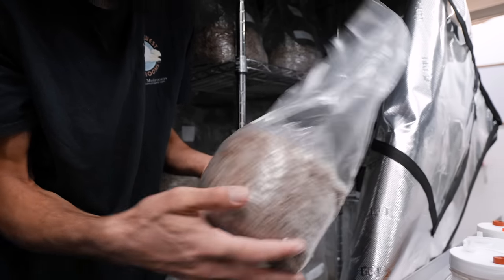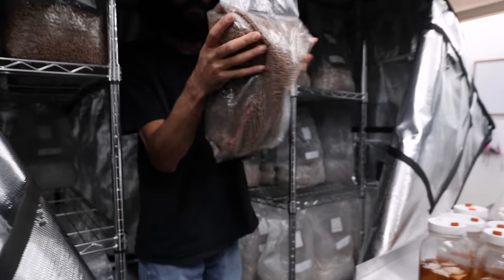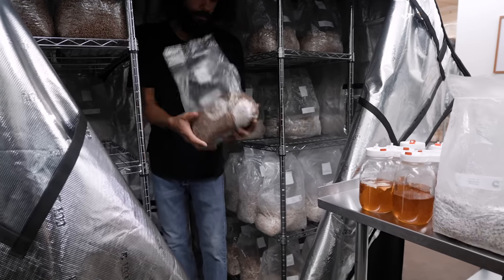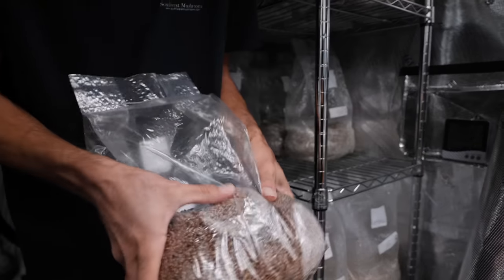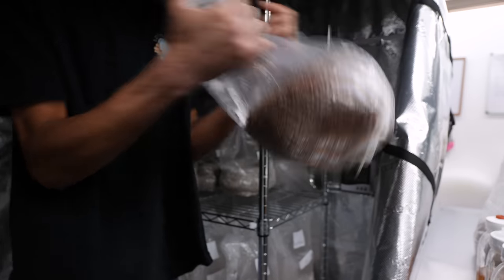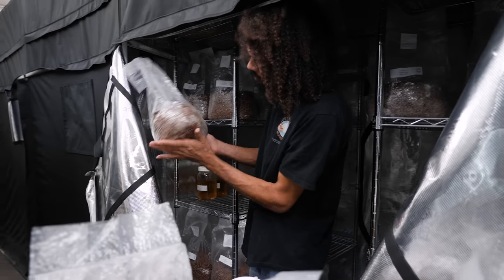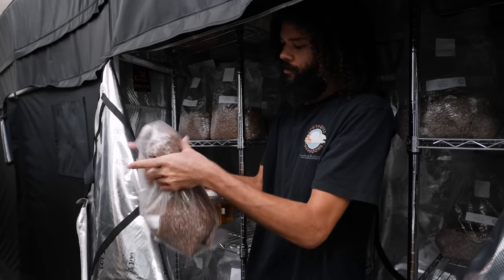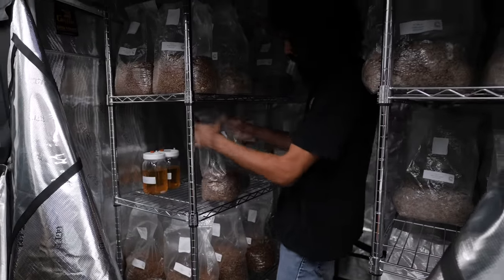You could shake this to speed it up or you couldn't. Same with this one — we'll break up this mycelium to speed up colonization. And we have some oyster mushrooms. I'm just going through my spawn, monitoring the growth, and basically shaking as needed or redistributing the mycelium.